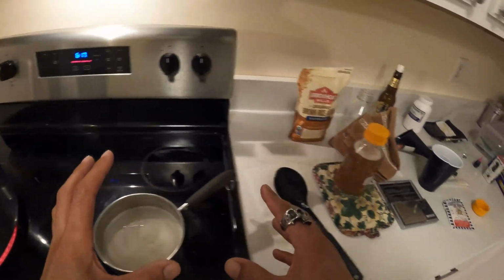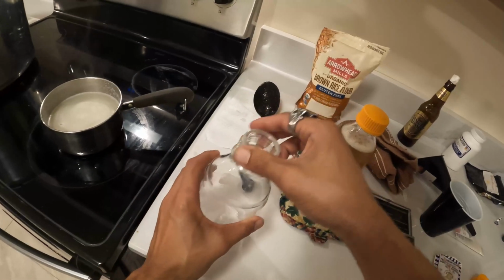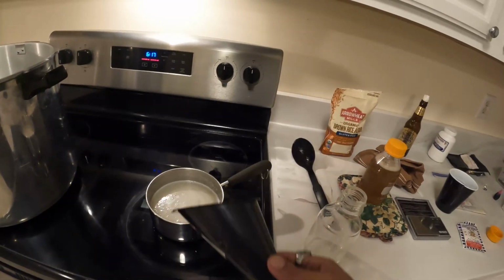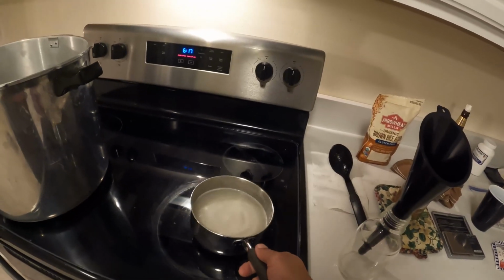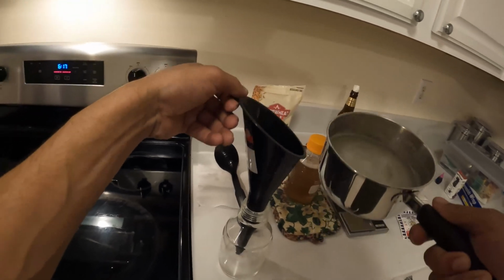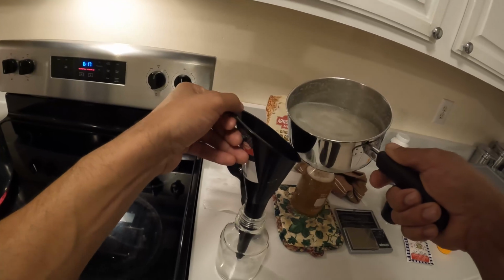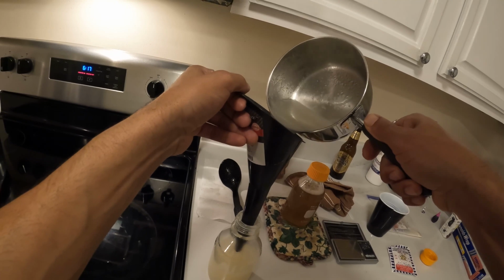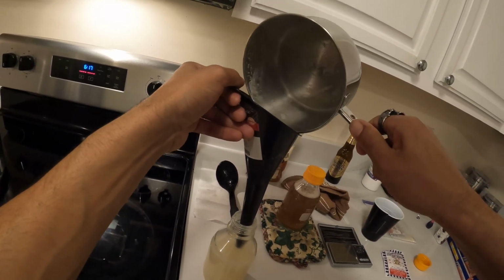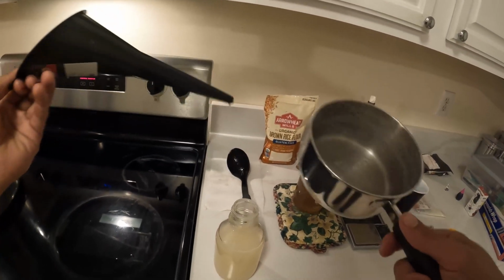So that's done there, and what we'll do is we will take the bottle, and I got a funnel here. You'll need a funnel if you're going from stovetop. This stuff is too hot, and if you don't have medical insurance, then you could be in trouble if you burn your hand really bad. So just play it smart. Go to the dollar store and get a funnel. All right, so that's done.